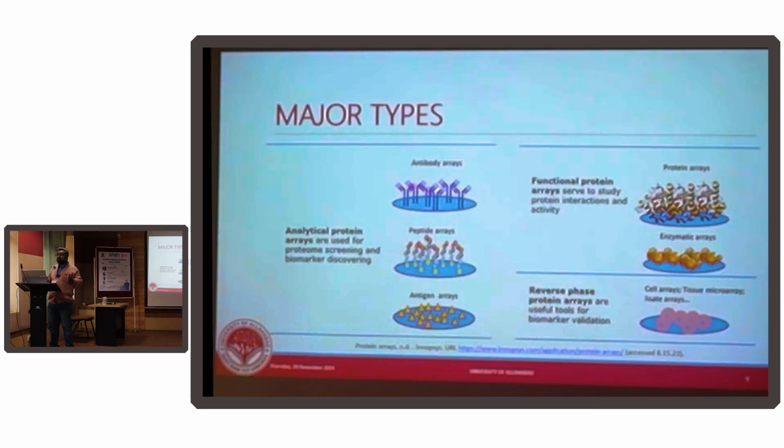Maybe you have a panel of around 50 or 60 markers. If you do, and you have to screen perhaps hundreds of samples. Now think that each grid contains 60 spots, and each of these spots in duplicate, that means a grid of 120 spots. Each of these duplicate spots is primarily an antibody against a specific protein in that cascade of signaling.